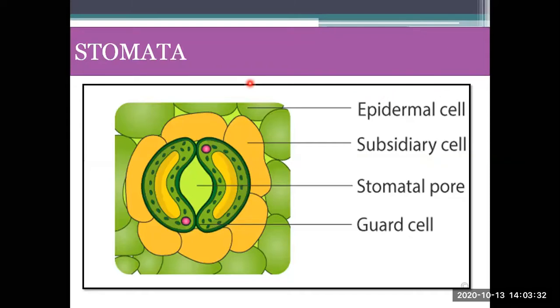The stomata and trichomes are the diagnostic features. So what do you understand by this term, diagnostic features? Can anyone? Identification marks. Correct. Diagnostic feature means the structure or part by which the plant can be differentiated from other ones. Many plants are distinguished on the basis of the presence of their stomata and trichomes. So today we'll discuss the stomata, its classification, and the different types of stomata.